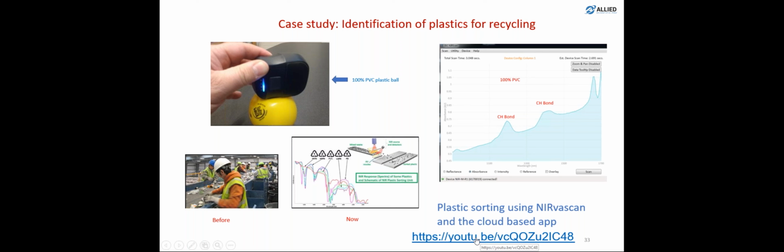There's a YouTube video here that you will see. I'm measuring from different types of plastics, and the data is directly saved into the cloud. The cloud runs the LDA model and identifies the type of plastic and sends it back to me. So this was a very interesting application.